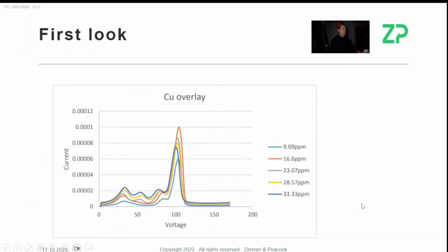Looking at their data, their concern is that they've got multiple peaks. I'm not concerned by this, and I'll try to explain it. But they're also looking at the biggest peak and they've got some concentrations here in ppm, from 9 ppm up to 33 ppm. Their concern is that this is the 9 ppm and this is the 33 ppm. I understand their concern, because they want the peak height or the area under the curve to be proportional to the concentration, which they've measured in parts per million, and it's not.